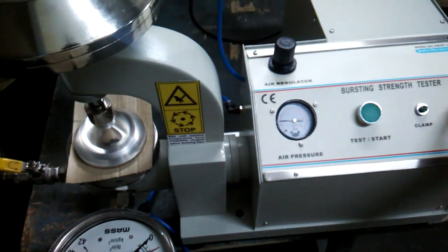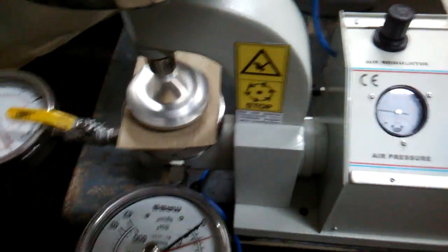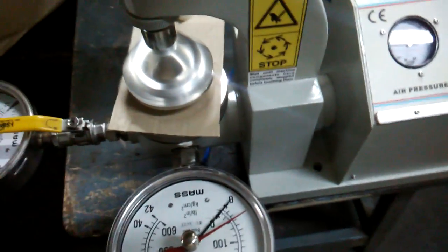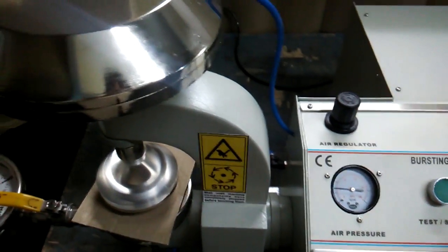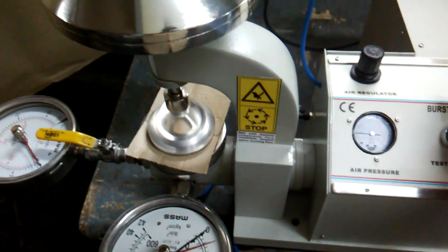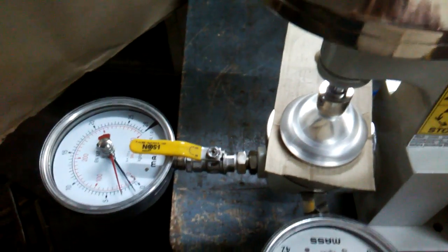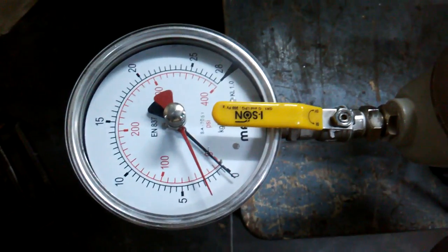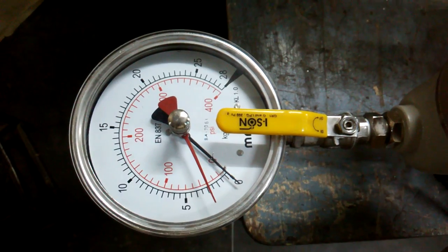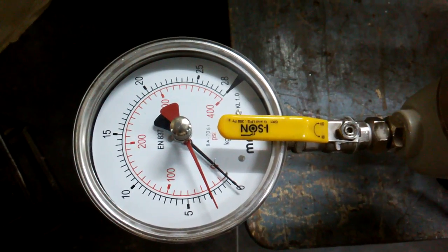We can release and check it here again by clamping and then pressing it. You can see it is 3 kg per centimeter square, or 35 to 40 psi.